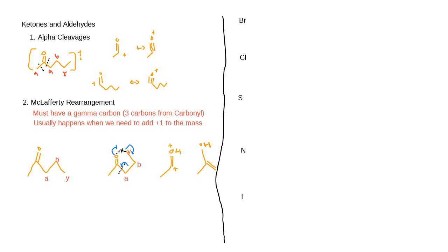And usually you have an M plus value and an M+2 value, okay, which just means 2 more mass on the graph. So it should be literally right next to it, okay? So I'm going to show what it should look like for each of these.